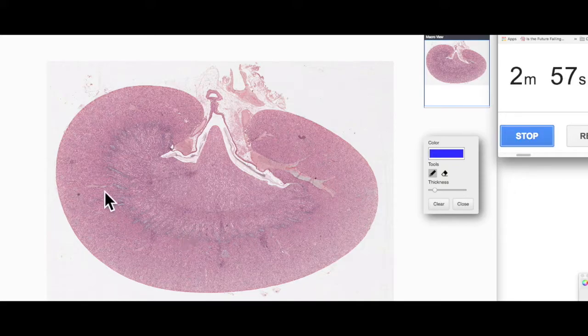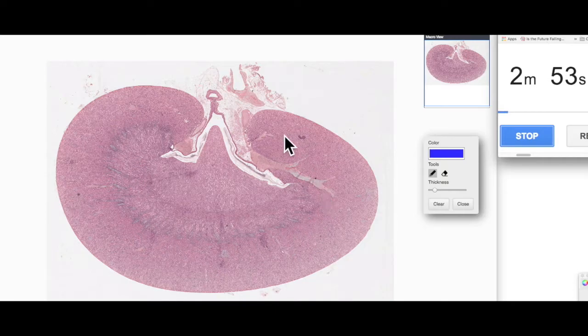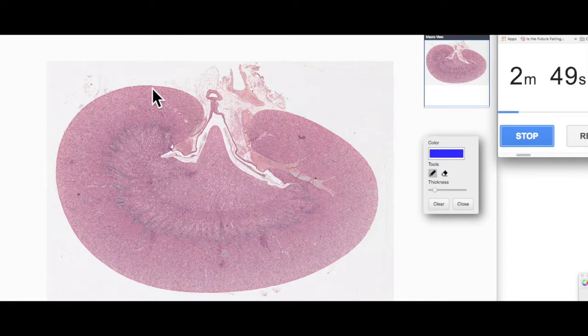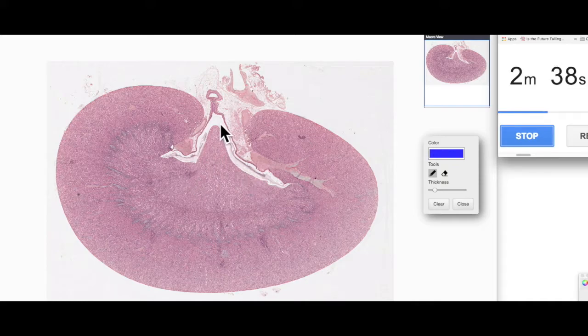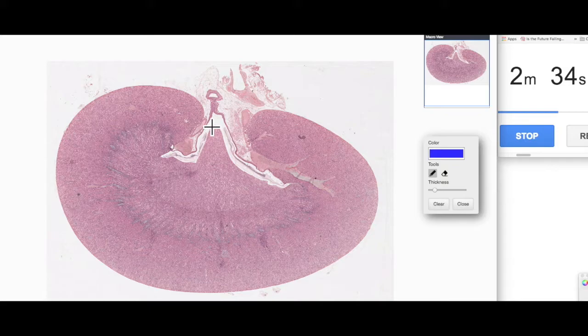You can see at this low magnification that the kidney is, well, kidney shaped. On the outside is a dense irregular connective tissue capsule, the renal capsule. The kidney's divided into two regions: an outer cortex, which is this tissue out here, and an inner medullary region. You can see the medulla ends in this peak, referred to as the renal pyramid, because it looks like a triangle.